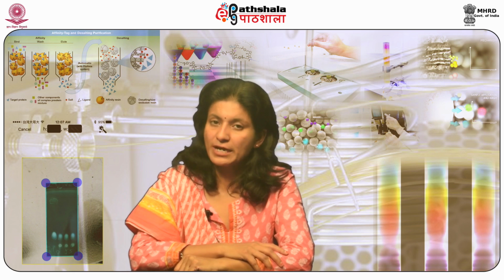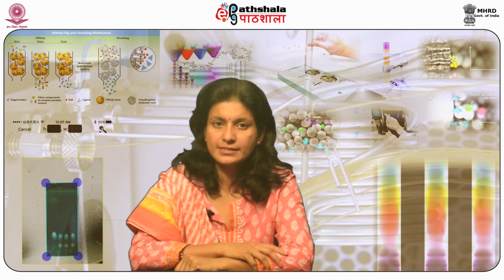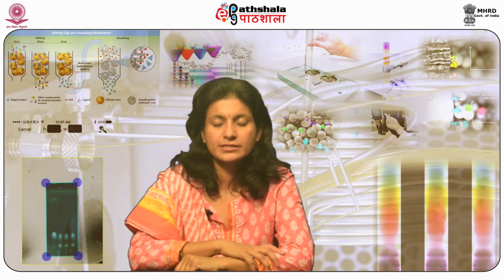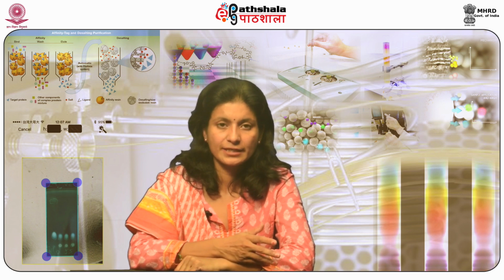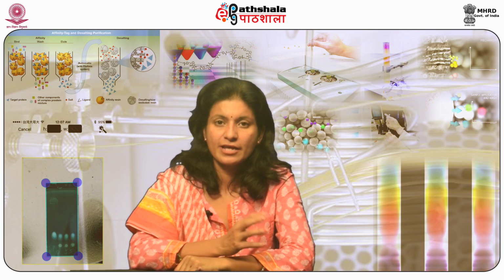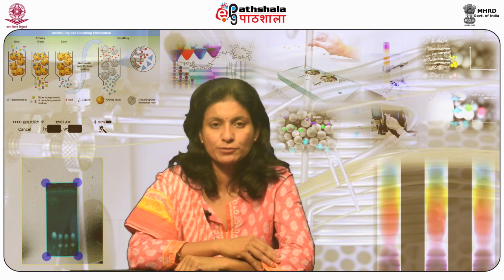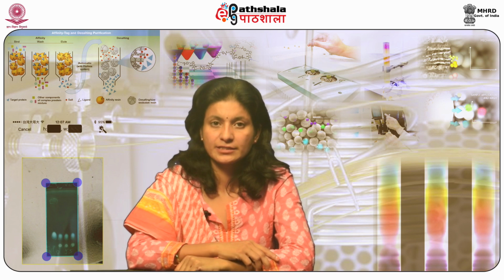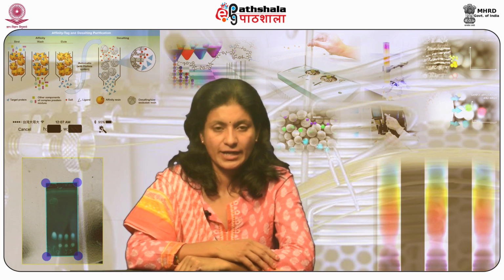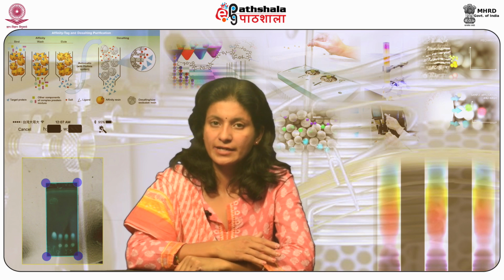Ion exchange chromatography provides a sensitive and authentic analytical procedure and techniques for the evaluation at minimum concentration levels. IEC is a beneficial instrumental evaluation technique which provides reliable methodology minimizing the detection limits. IEC is the most determined approach for the evaluation of organic and inorganic ions.